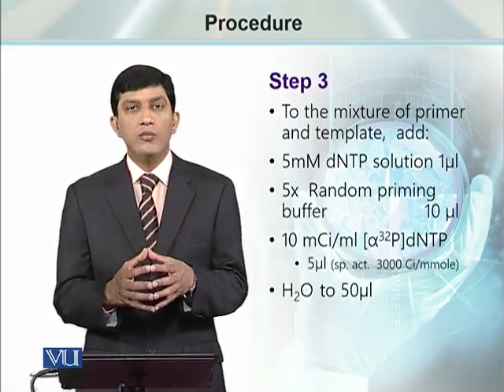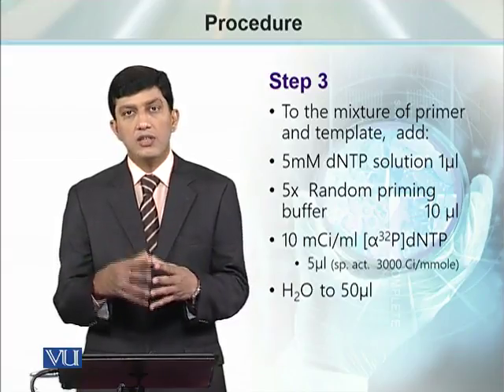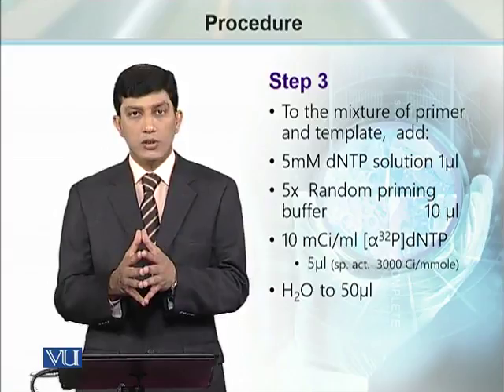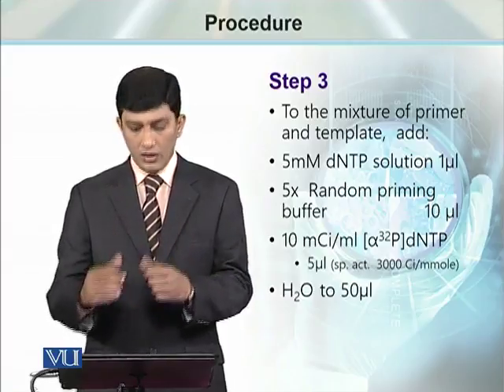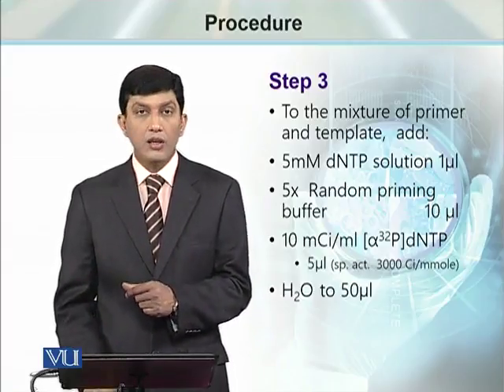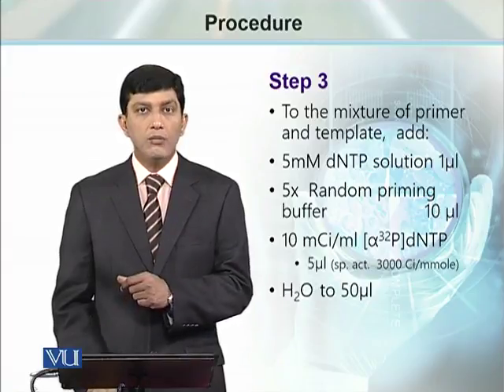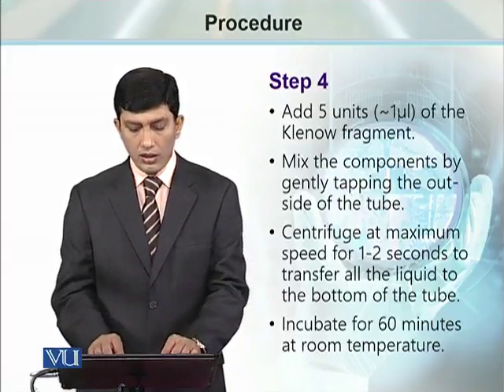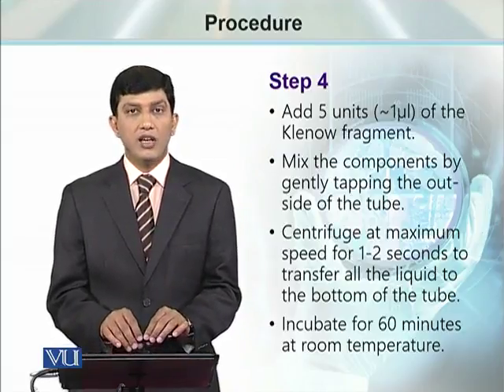The final volume of this reaction mixture is adjusted to 50 microliters with the help of water.